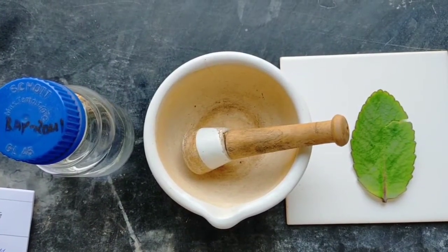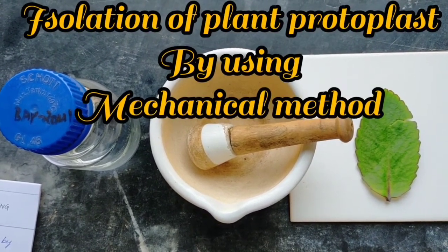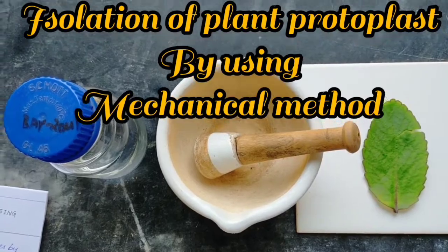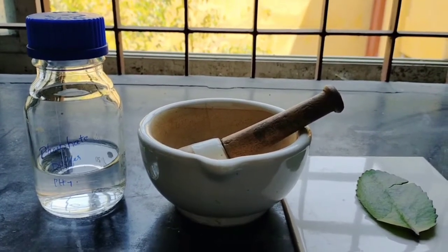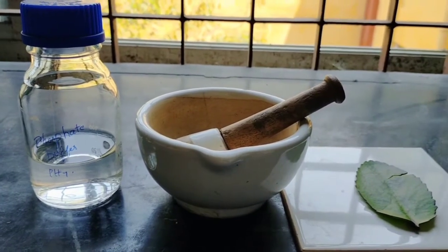Hello guys, in this video we are going to see about isolation of plant protoplast using mechanical method. The main aim of the experiment is to isolate protoplast from leaves by using mechanical method.